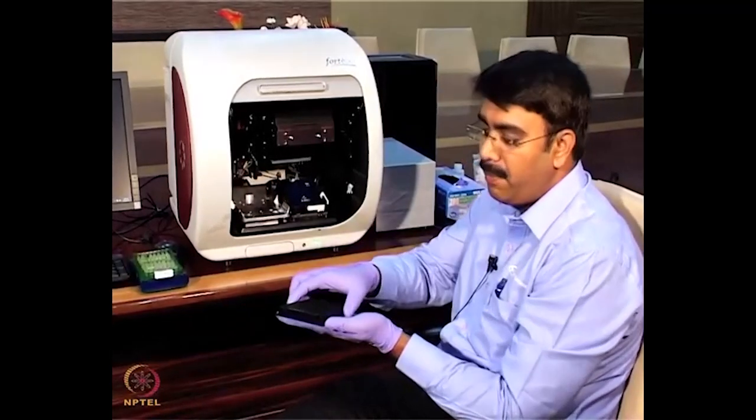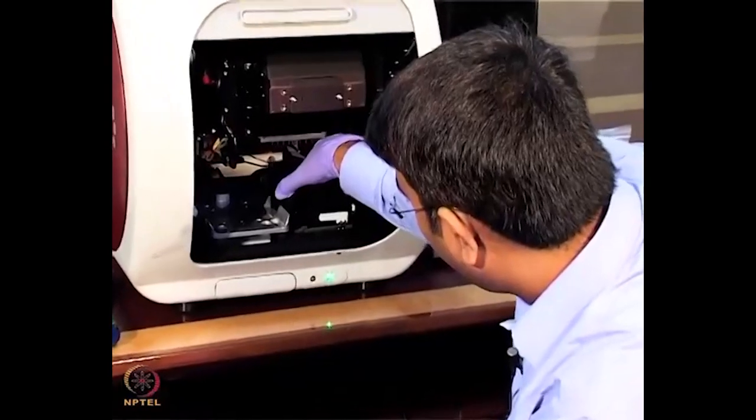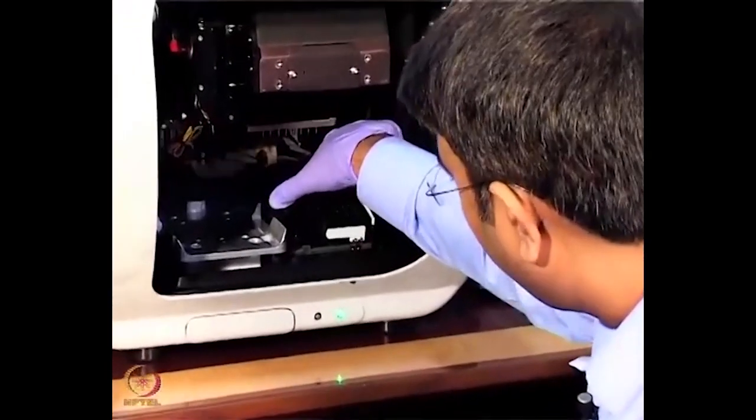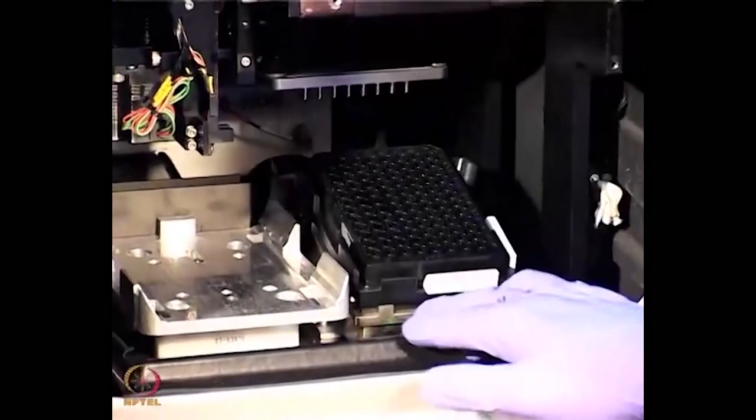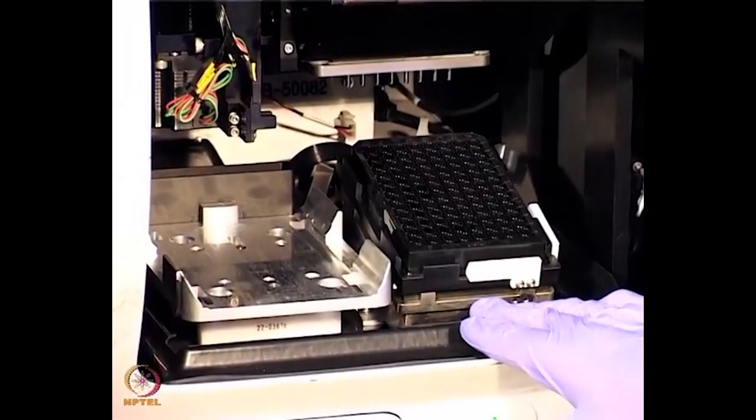This is the sample plate, a 96 well plate. I am going to place it in the sample compartment here like this. There is a click sound, it comes in firmly and fits into the sample compartment. Here, if you look at the sample compartment, it works on dip and read. The BLI technology works on the dip and read method.